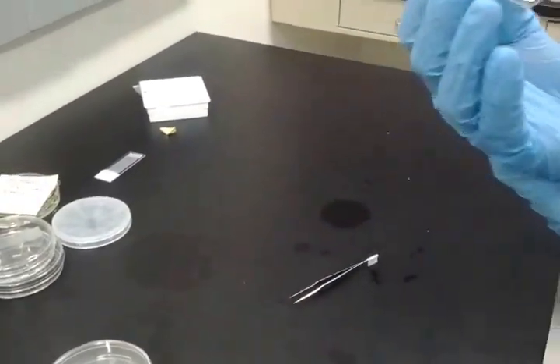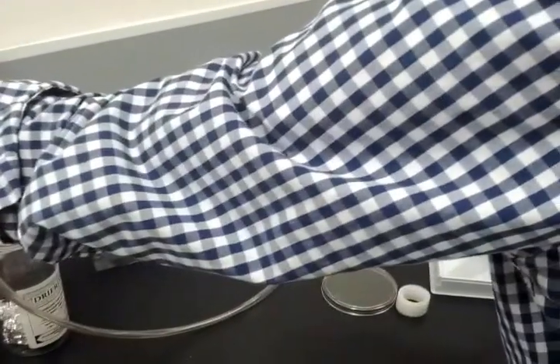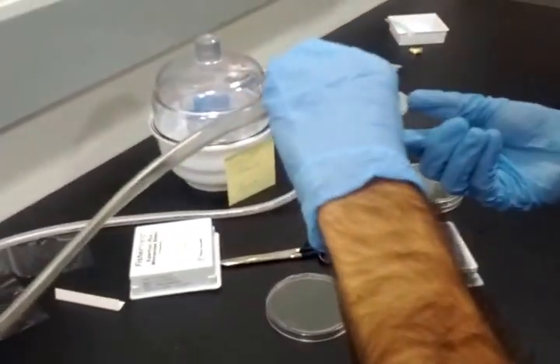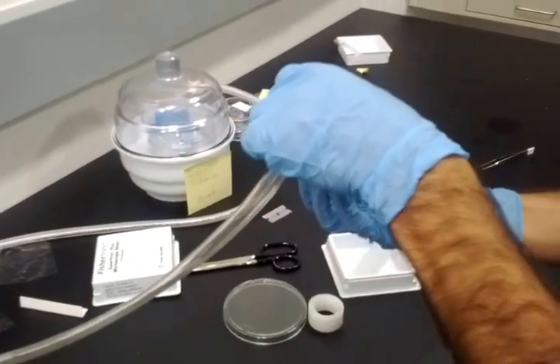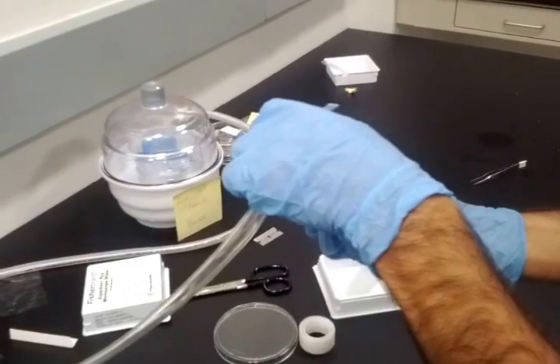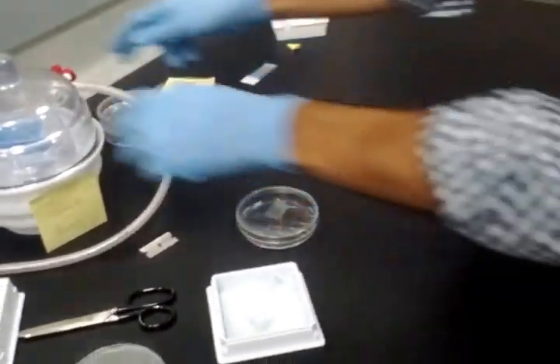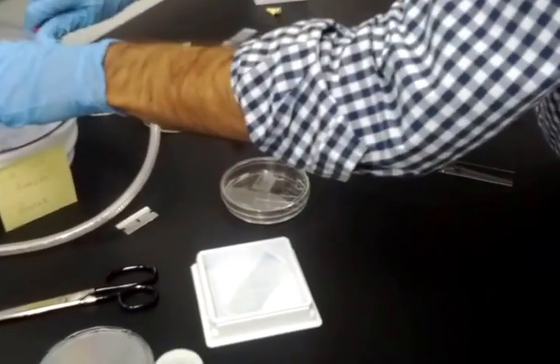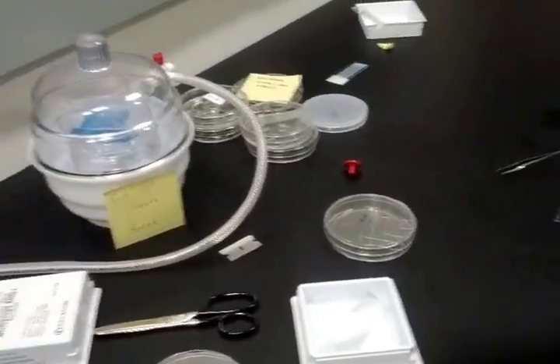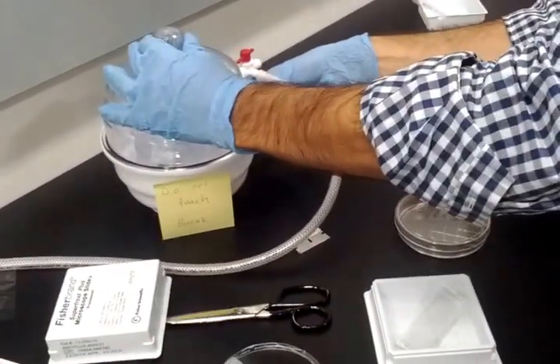Okay. To make sure that the PDMS surface is even cleaner, because this is from a while ago, I'm going to clean it again. Okay. Put some nitrogen. These have been kept in the desiccator to have them more stable.